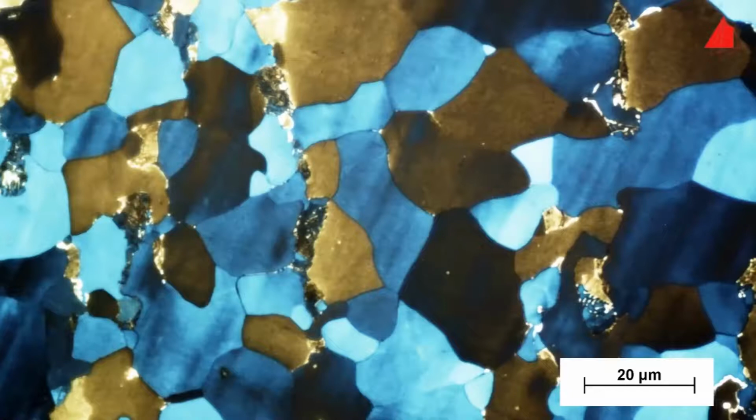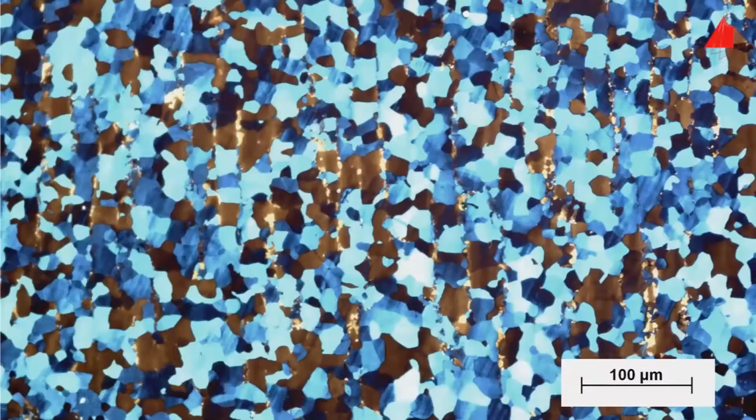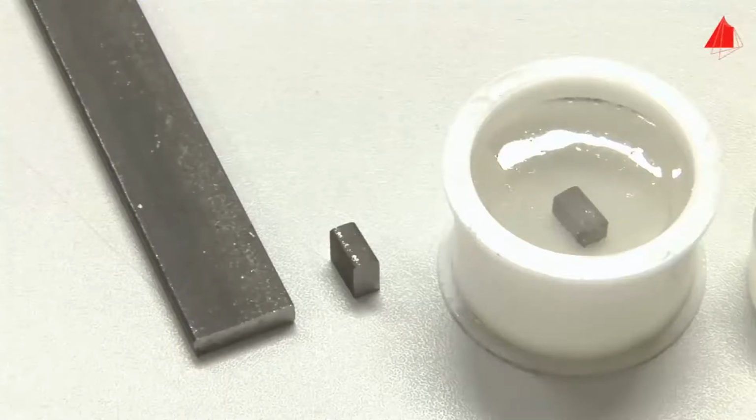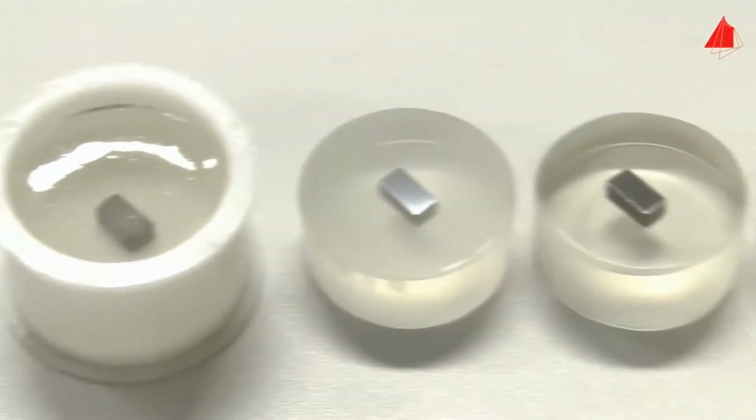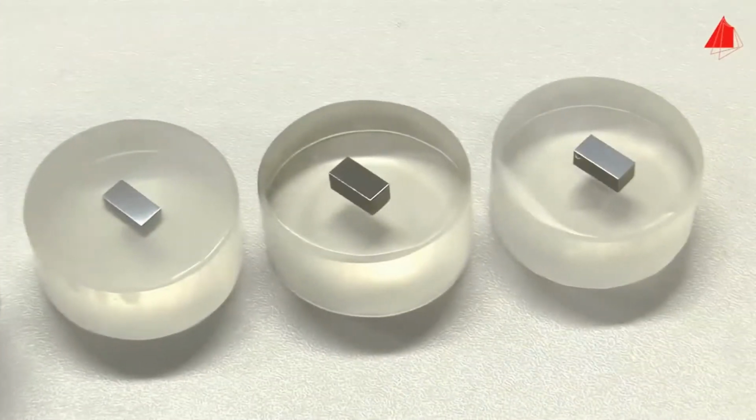The variety of materials is huge, and each material needs its own individual preparation method in metallography. The preparation is often not conducted by hand as shown here, but by automatic methods. This saves time and money. The principle, however, is always the same. Sectioning, mounting, grinding, polishing, and etching.